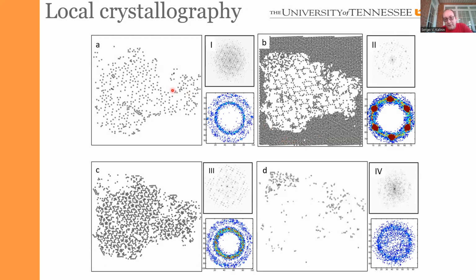So we can split this image further. As you can see here, there are 4 clusters, and you can visualize the spatial localization of the atoms in each of the 4 clusters. Since Fourier transform is a great way to highlight what goes on, we can separate the atoms based on the chemical neighborhood and calculate the Fourier transform.